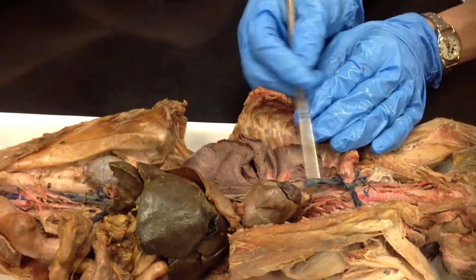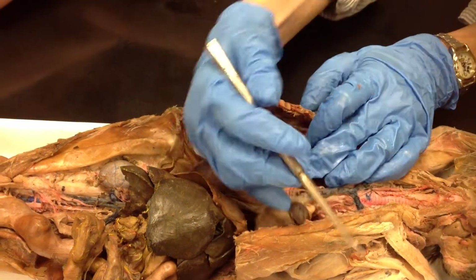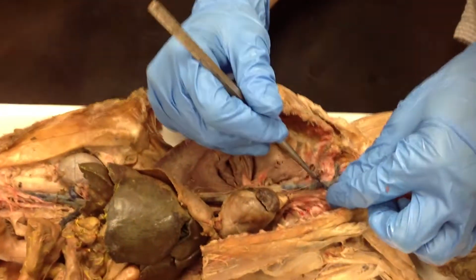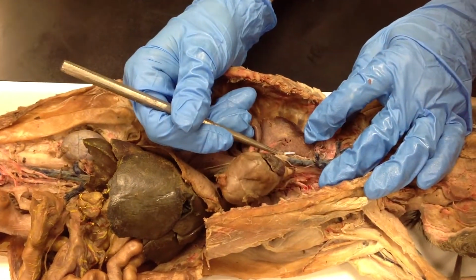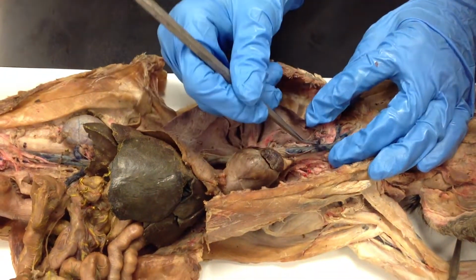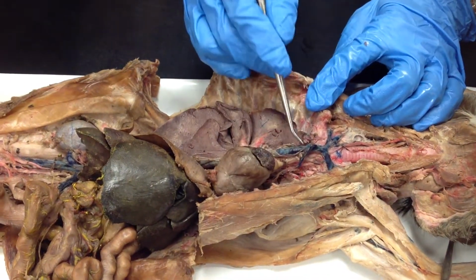So this is our superior vena cava. It's draining blood from the upper body back down to the heart. Okay. You have a major branch right here behind the heart. That's the azygos. It's behind the heart. And coming up here, this thing that's flapping in the breeze here, that's your mammary vein. That thing.